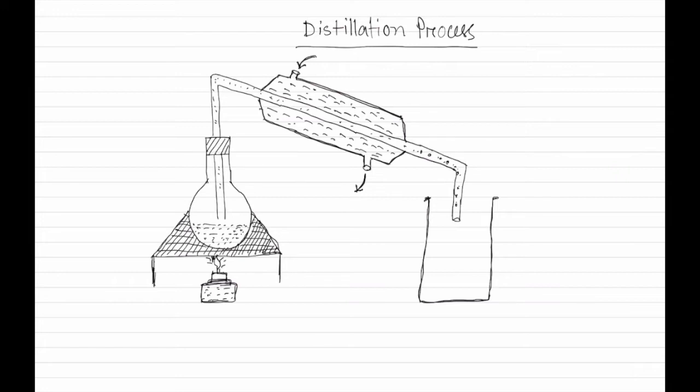There is no gaseous substance, and the drop of water finally drops into the beaker. And this beaker starts storing the water. This water is distilled water. This water is known as distilled water.